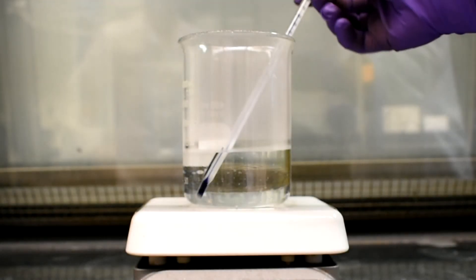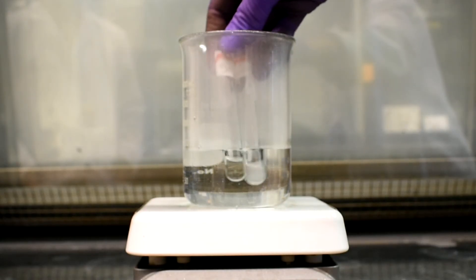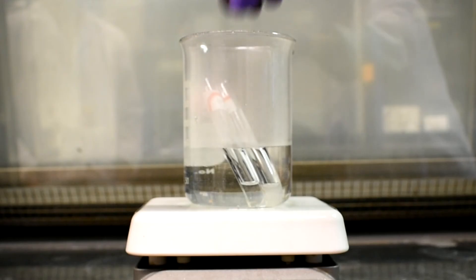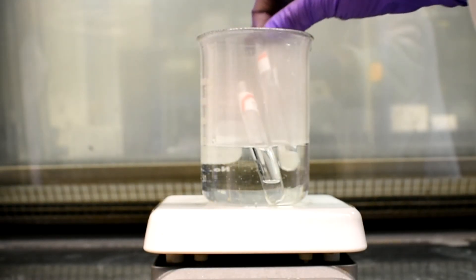Using a 400 milliliter beaker with water and a hot plate, heat the water to about 70 to 80 degrees Celsius. Place the tubes that had no reaction in the beaker to see if a reaction can occur with heat. The liquid in the tubes should be discarded in the heavy metal waste.